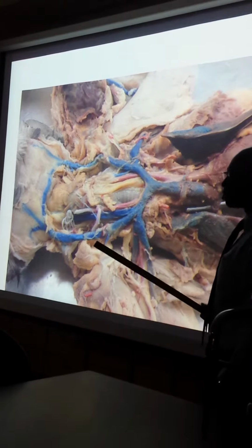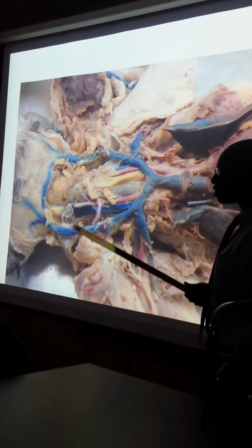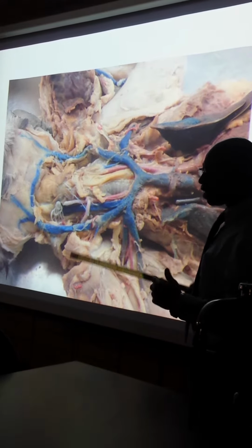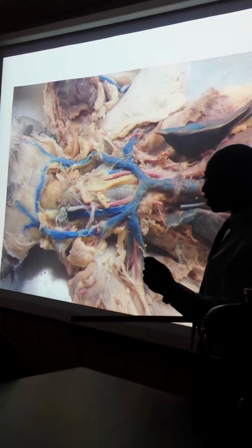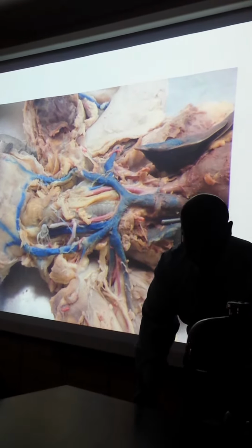And I want you to use the diagrams I gave you. They have pictures from top to bottom of the cat, veins and arteries, okay? It's one of the handouts I gave you. And also use the lab manual, I wrote it in the email as well.